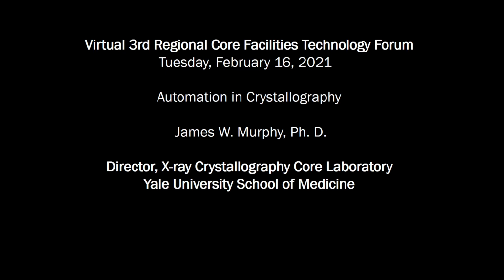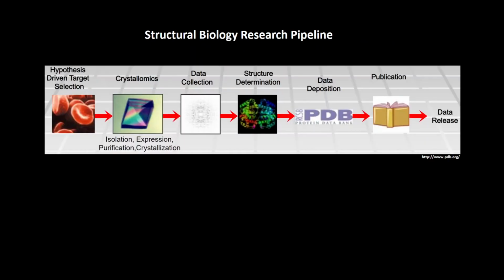Today I'd like to discuss the value of automating portions of a protein crystallography pipeline and the application of automation in an academic setting. I will also discuss instrumentation in our core laboratory and how it can be successfully integrated into a structure-based scientific project.